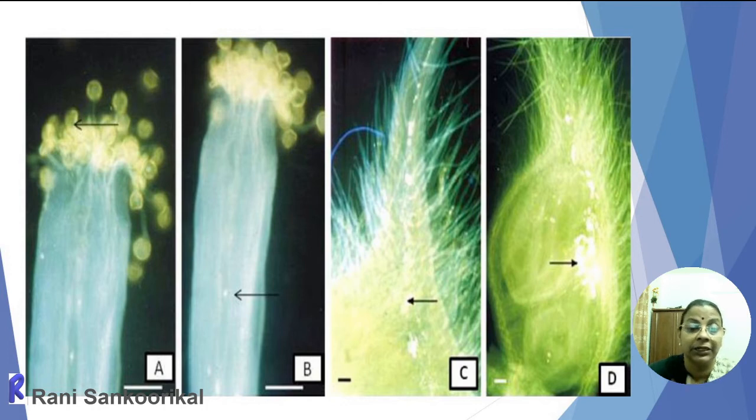So it is the stigma in the pollinated pistil. This also I have included. When you take the flower and cut the pistil alone and keep it under the microscope, you can see different pollens are already there on the stigma, because as soon as the flower is open, pollen from other flowers will land on the stigma, and pollen germination will take place, and at the same time the different stages of pollen tube development can also be seen through the microscope.